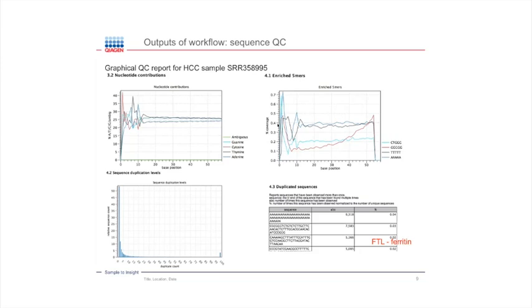You can see that the percentage coverage on the y-axis is about 0.1% to 0.7%. And what we're looking at is at each position, what is the most overrepresented 5-mer? And what percentage of the reads is that in? And you can see that basically it's about 0.4% for the most overrepresented one, which isn't much different from what you'd experience by chance. So this looks like a very good library. It doesn't have a lot of bias in it.